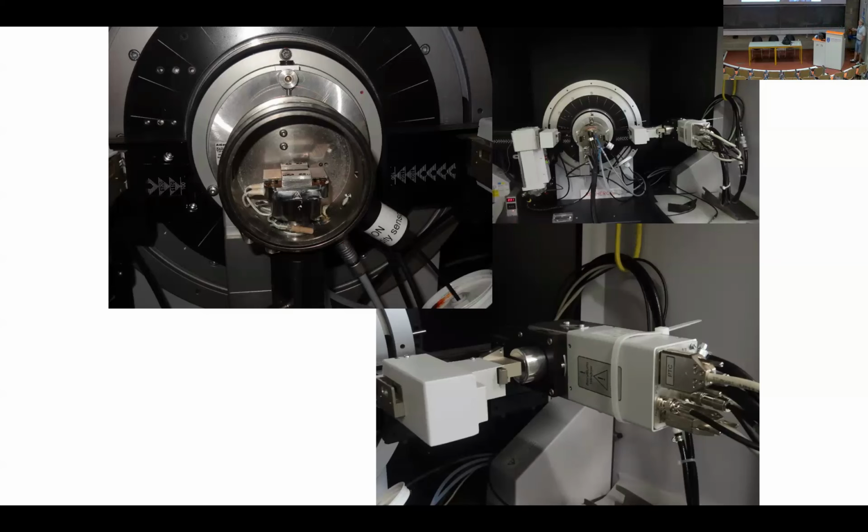More recently, but already more than 30 years ago, there were detectors that allow you to select the energy of the outgoing waves and to select only the ones that have interacted elastically with your material. Why is that?